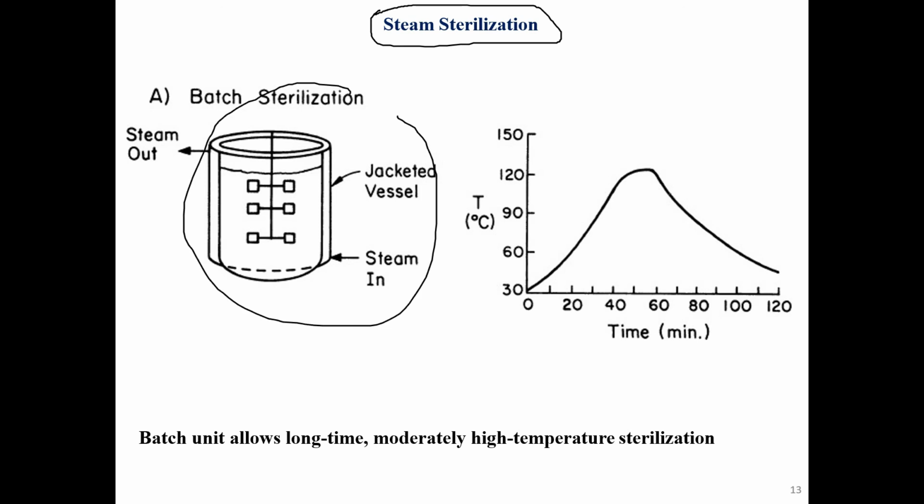In this we keep our racks or a particular vessel in which we have the particular microbes or bacteria which we need to sterilize. We have a lid here as well, so we close the lid and switch on the button.